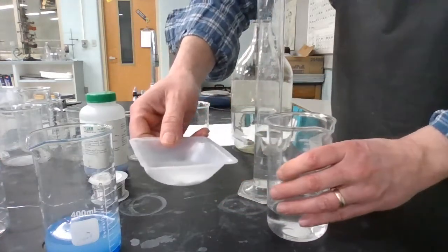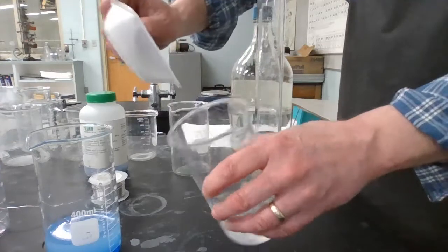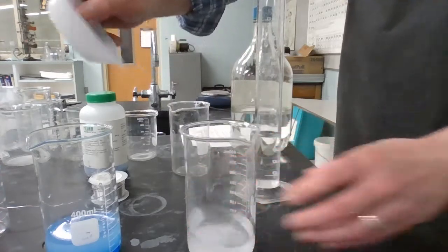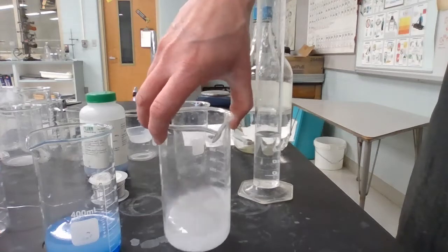So right now they're stuck together, but we're going to put them in solution. And then they're going to separate into sodium, which we know is kind of harmless. You need sodium in your body, sodium ions. That hydroxide ion, that's a strong base, and that's why this is kind of a dangerous chemical.